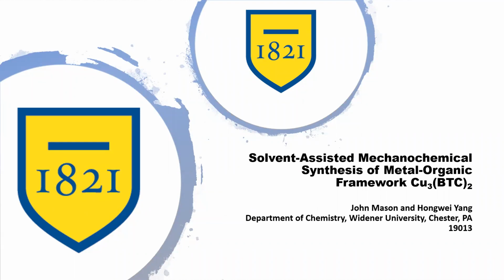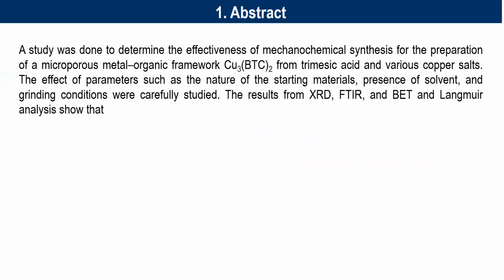Welcome to my presentation on solvent-assisted mechanochemical synthesis of metal organic framework copper BTC. In this research, a study was done to determine the effectiveness of mechanochemical grinding for the preparation of microporous metal organic framework copper BTC from trimesic acid and 3 different copper salts. The effects of parameters were changed, such as the different starting materials, the presence of solvent, and length of grinding. These were then viewed using XRD, FTIR, BET, and Langmuir analysis.